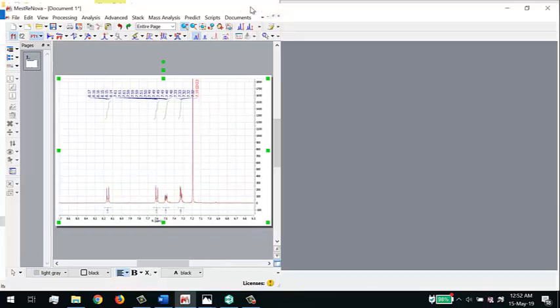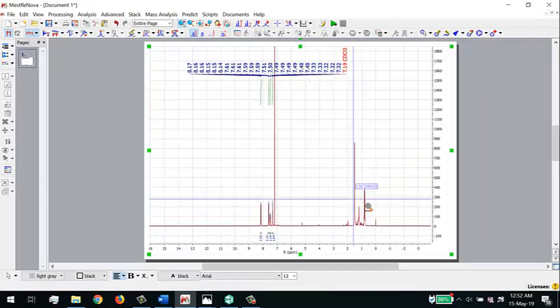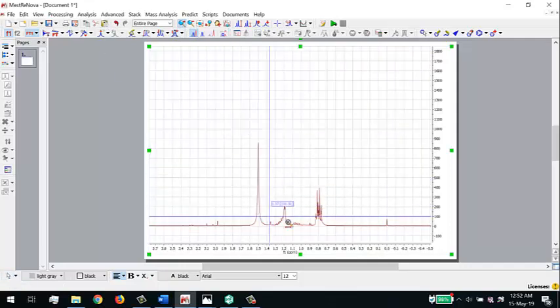However, if we take a look again at our spectrum, we see that there is a whole bunch of peaks over here. If this is our sample, what are these? First, let's take a look at this peak specifically. Just a general feel, looking at this peak, it's pretty wide, could be water.